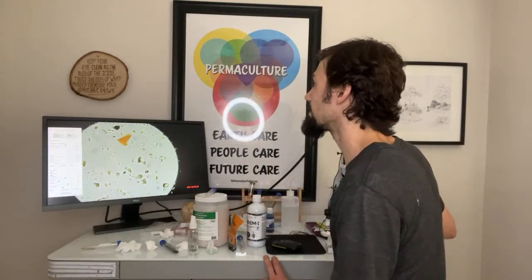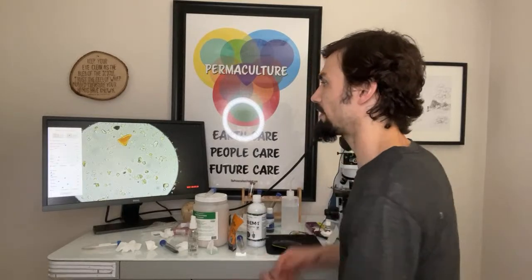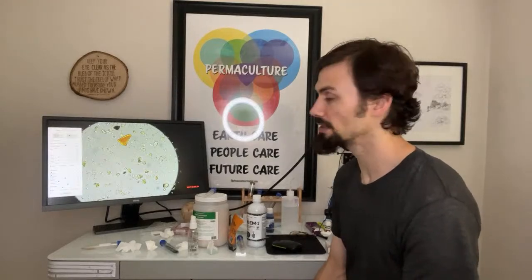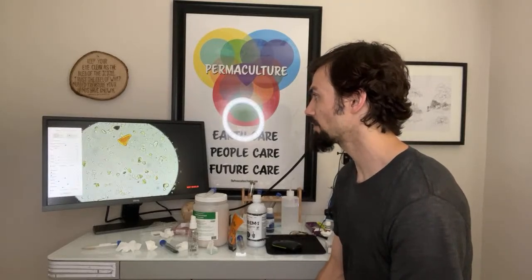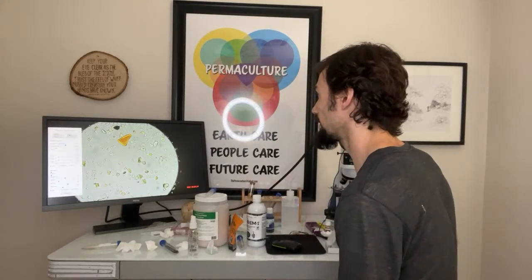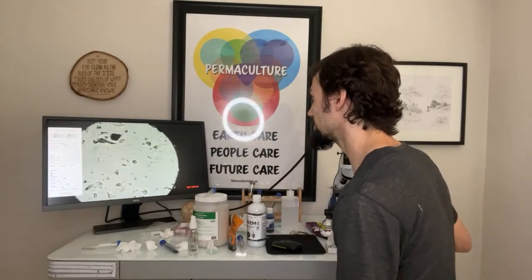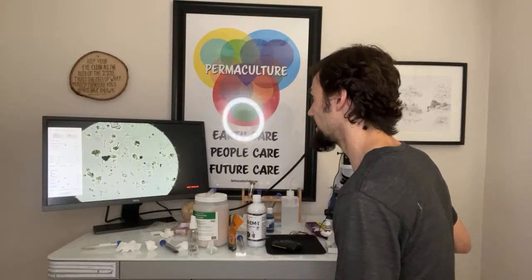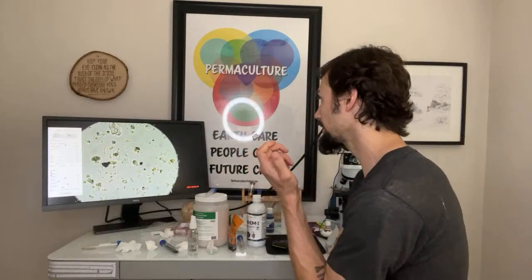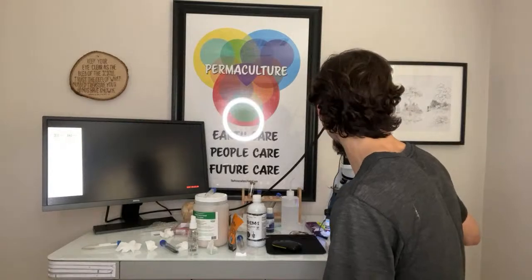Super interesting though. Yeah, I would love to get the polarizer on that and run it through the degrees, and then we would see what it's made of, because everything has an actual frequency that it resonates at. So you can tell those sorts of things with the polarizer. But yeah, this is spores and the aggregates, the organic matter aggregates, which probably have more spores in them, but let's go into the epifluorescence and check things out.